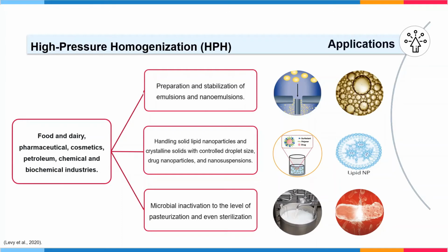It can induce a reduction of the microbial load of food products to the level of pasteurization and even sterilization, depending on process parameters.